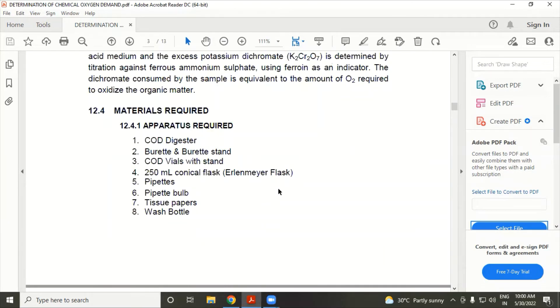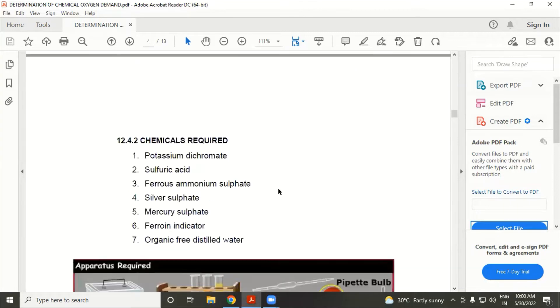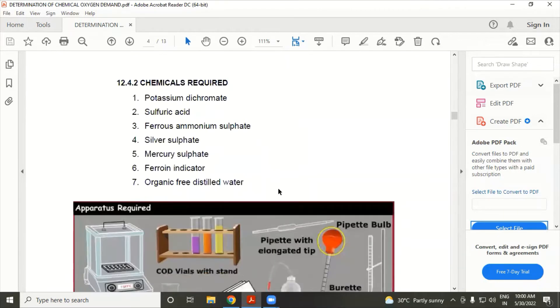The apparatus used includes: COD digester, burette, COD stand, conical flask, pipette, tissue paper, and wash bottle. There are also some chemicals used in this experiment.